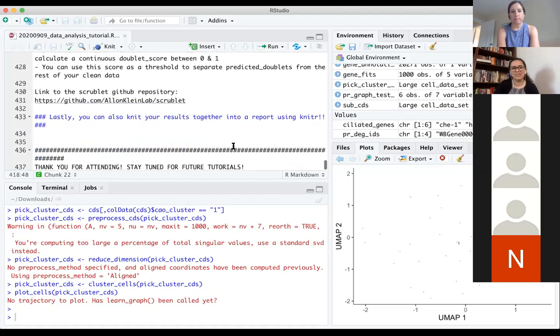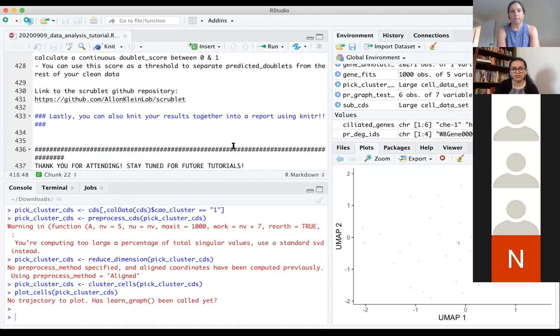And so for biologists in particular, when they're working on the data, they are very amazed when it can all be aggregated together. All your analysis can be aggregated into a single document. This is done by knitter, or knitr, however you like to call it. All of this analysis that we've done from beginning to end, you can knit together.